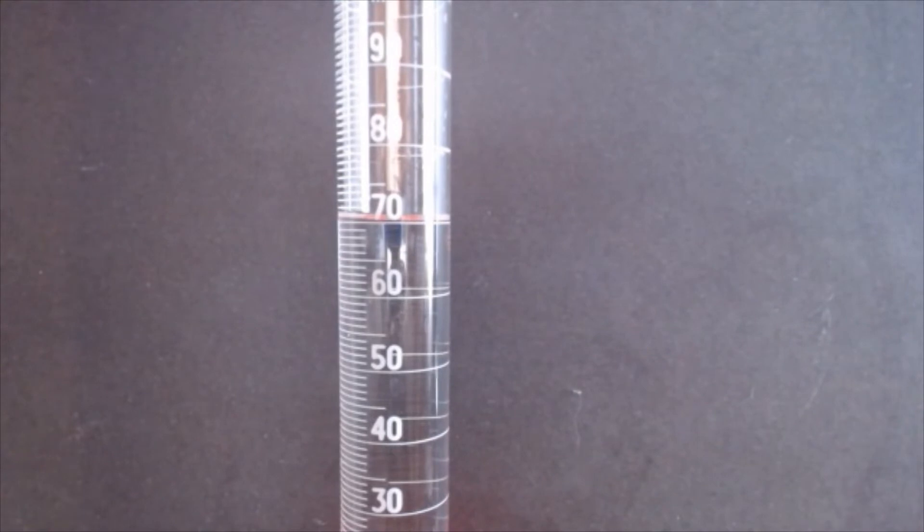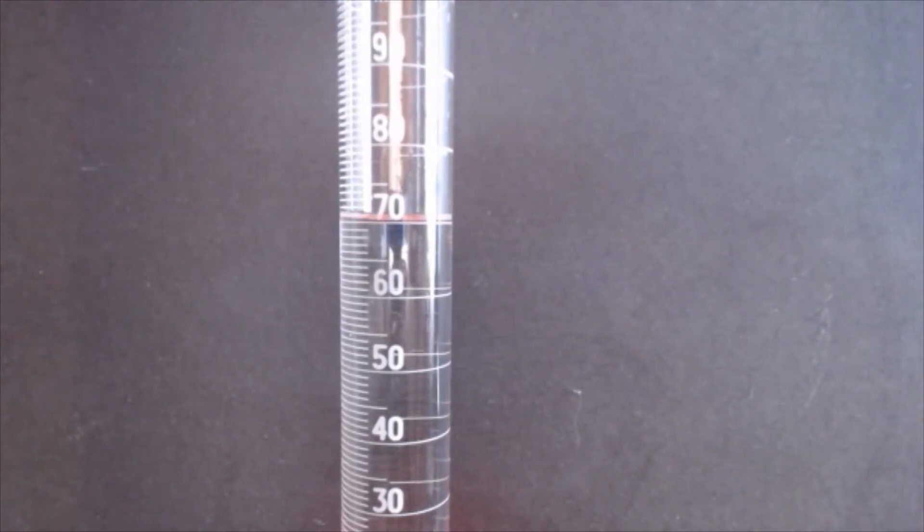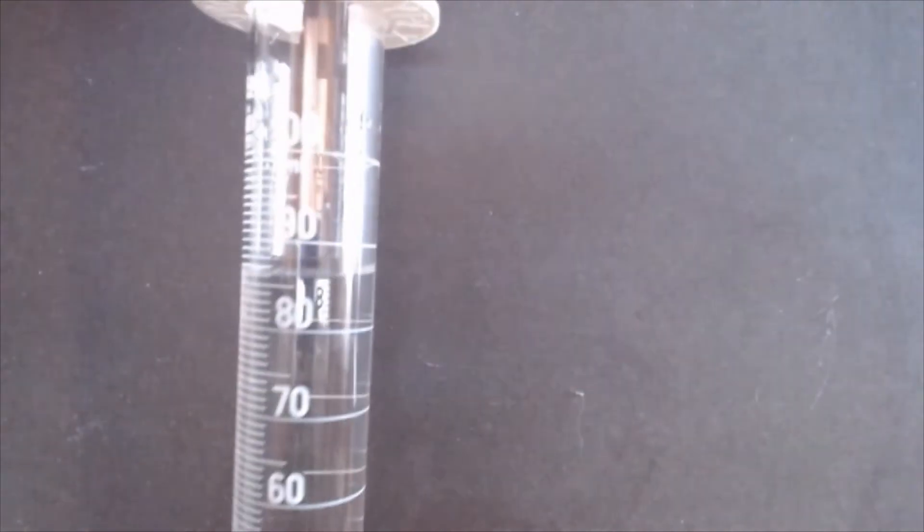So now what I need to do is add my silicon pieces, and then we'll find the difference in volume. So hopefully you can see I've added my silicon pieces. They're inside my graduated cylinder. So I'm going to try and adjust this into the camera view so that you guys can make a reading.